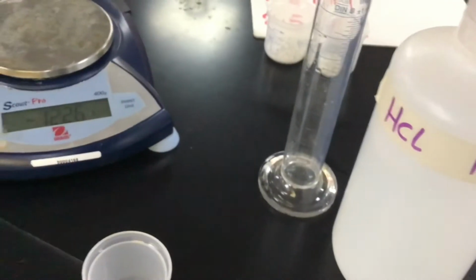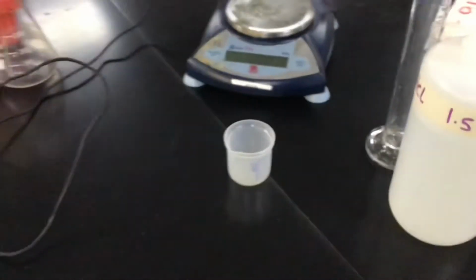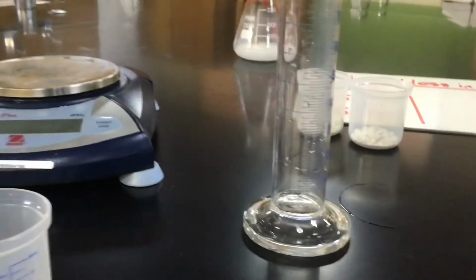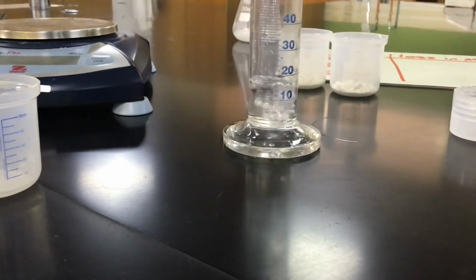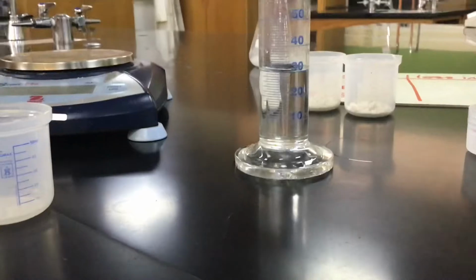So now I have the 1.5 molar measuring cylinder. I'm going to measure out 30 again. Sit it down, twist it round so you can see it. Perfect. 30 ml of 1.5.